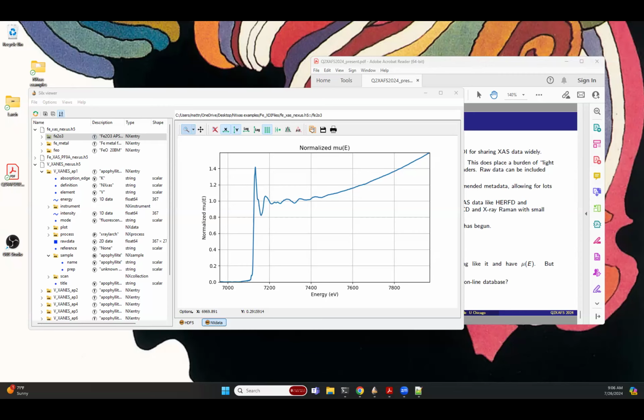Well, yes, of course. Compared to tomography, we are a pittance in terms of data. But when you start to add evolution, mapping, QuickXAFS, multiple element detector, you could soon reach, not the size of a tomography scan, of course, but you increase in size, and portability is more than readability. How long will the software take to process all the data, all the search and everything? It is more about the post-processing part.